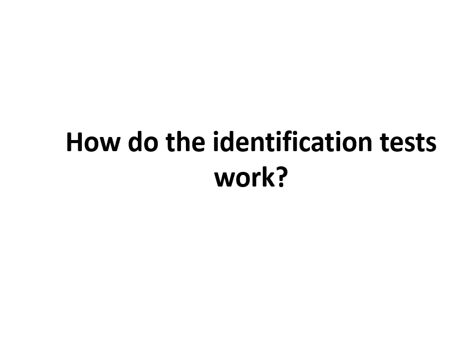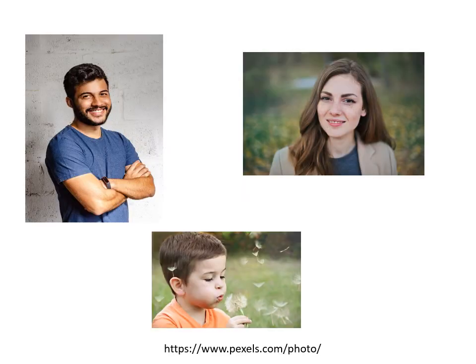In this video, I'd like to tell you how the identification tests work. Usually, we consider an identification test as a test which can give us information about paternity, to confirm or to exclude the paternity. But you have to keep in mind that they are also used to analyze biological traces.